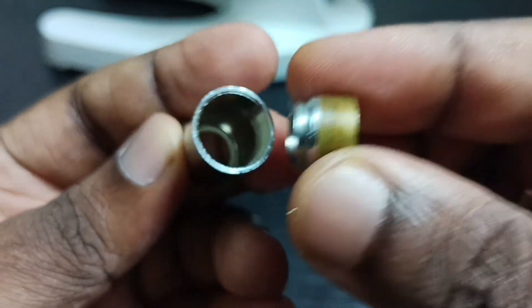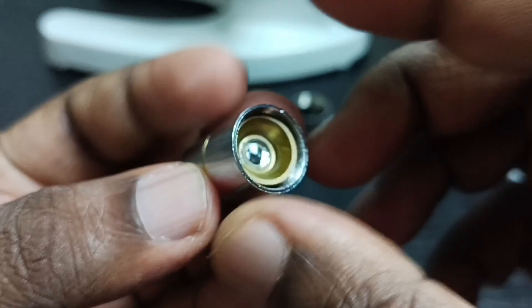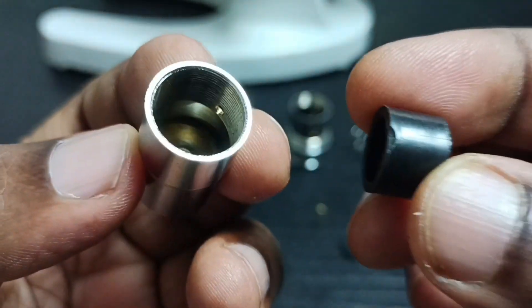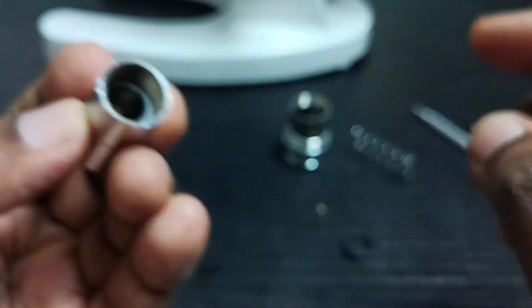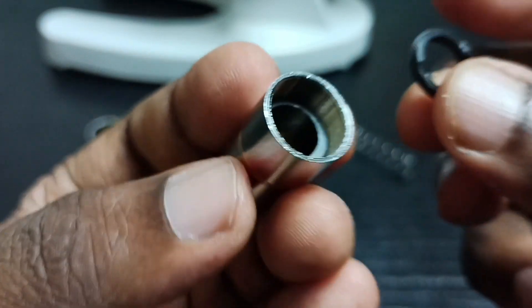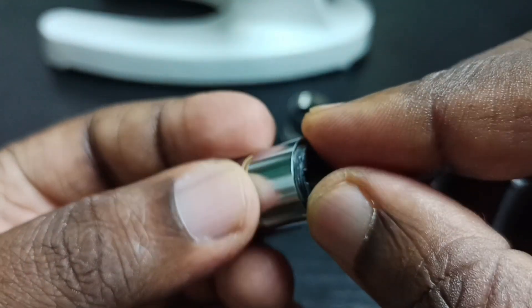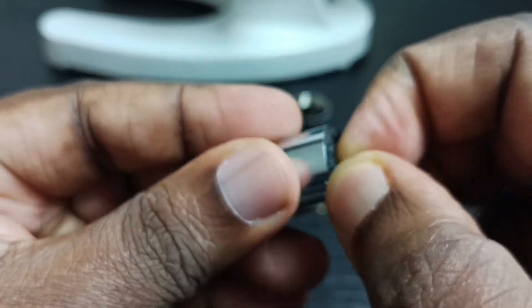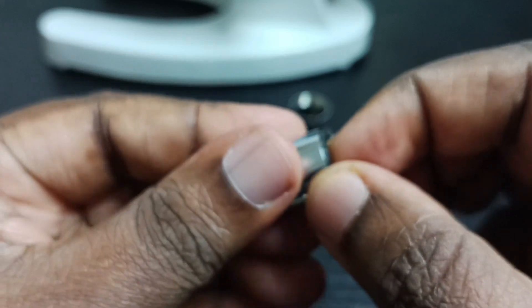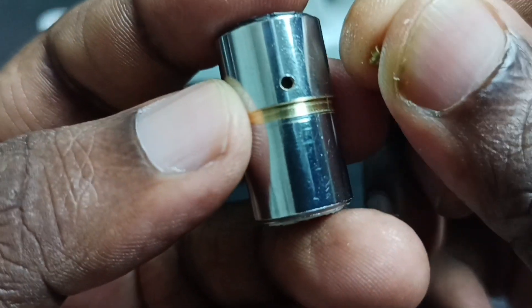After cleaning you can put it back. First we can put this lens inside, then this plastic. Using this plastic we can tighten, then we have to put this screw here.